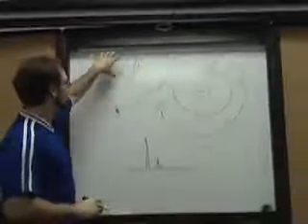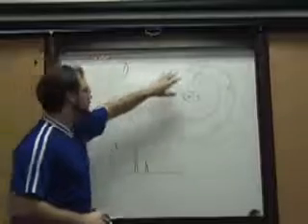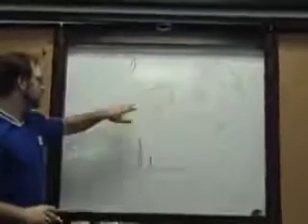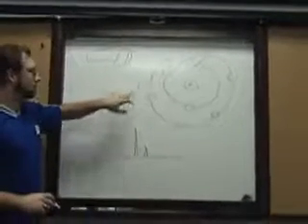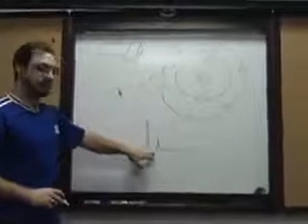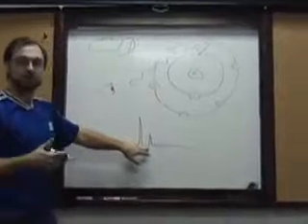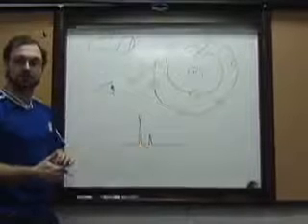We're creating X-rays with our X-ray tube, causing the fluorescence, measuring the energy of the X-rays that come back, and then linking each of those energies to an element. Once I know what each of the elements are, I can figure out the concentrations.